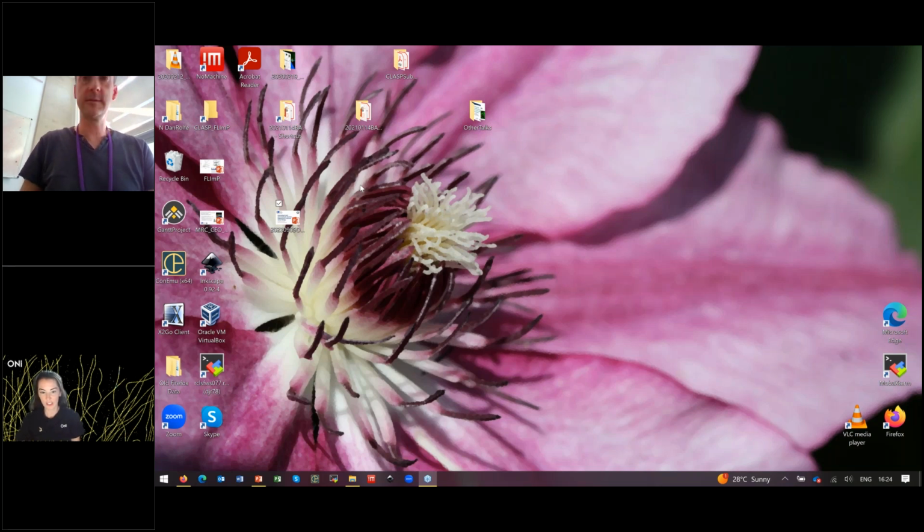Great. Our next question: could you have used any other microscope to automate FLImP? So we could have used any single molecule TIRF microscope that is fully scriptable and automatable. And as far as I know, the Nanoimager is the only one. So we identified that. That's what we needed it for in the first place. So we're not aware of any other.